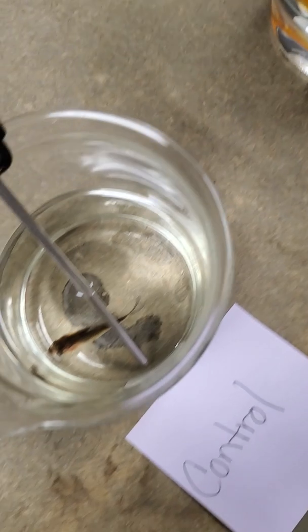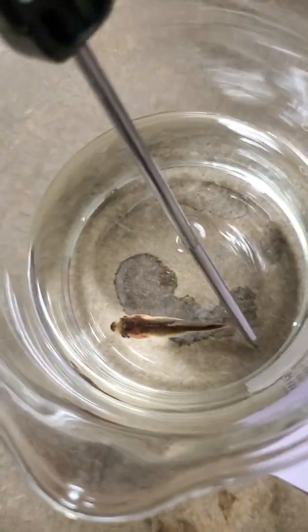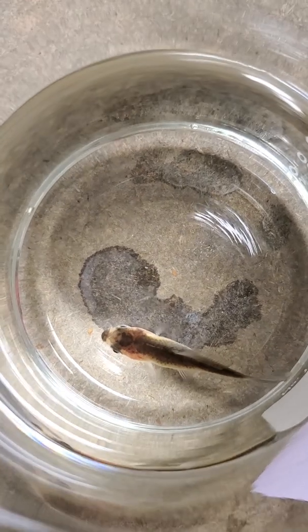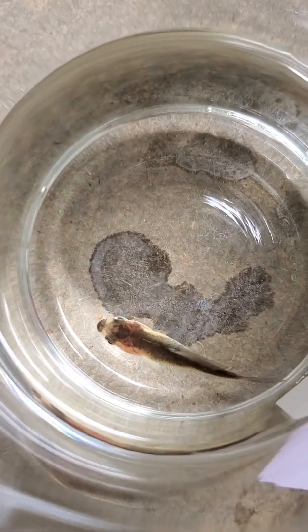And time. We're going to go back to our experimental. It is 18.2 degrees Celsius. Or we're going to go back to our control, sorry. 18.2 degrees Celsius.